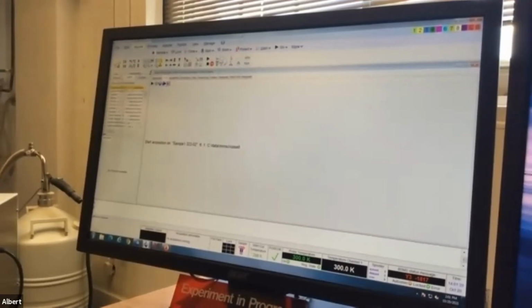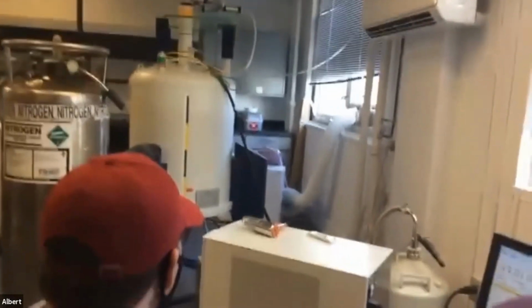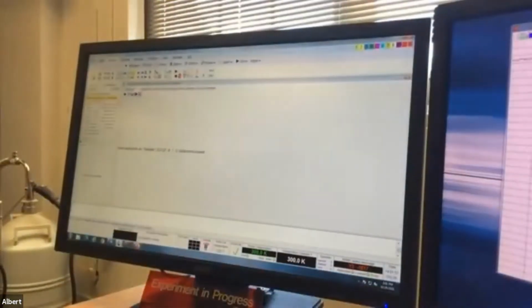Yeah, it does. Okay. And then gain. What the gain is doing is now setting the receiver up over here, this box on the floor. That's the receiver, and that's going to talk to the magnet. But we have to set the receiver gain so that they'll know how to communicate with each other. All right. And then once that's done, click go.